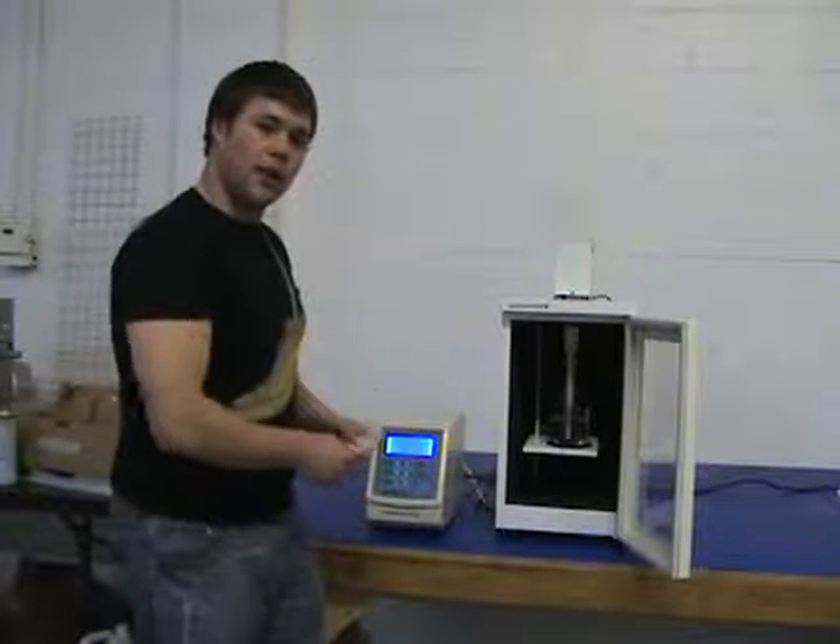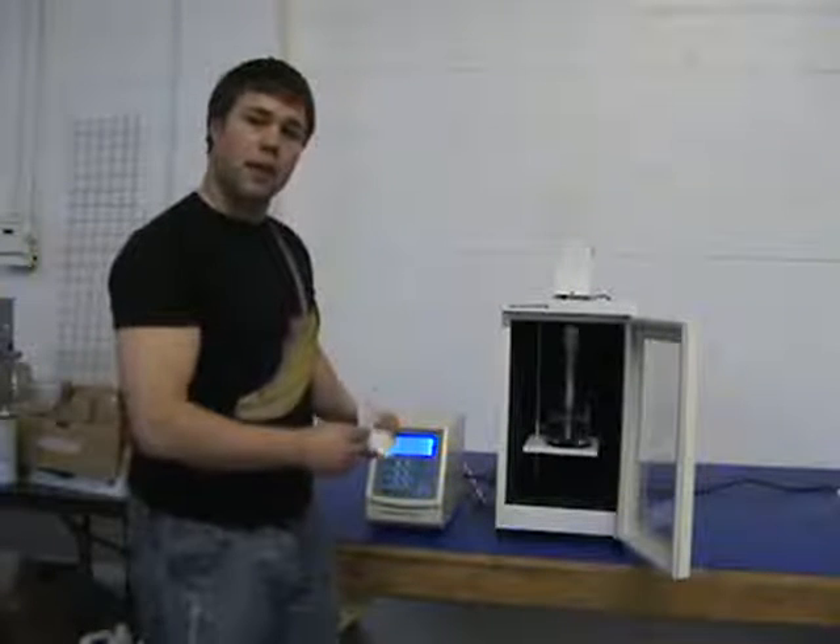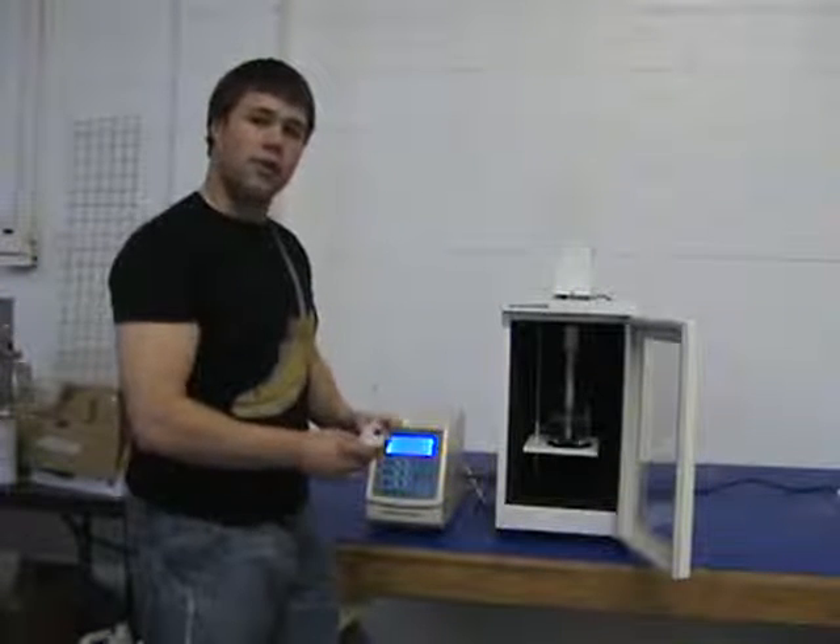With this device here, we can homogenize mixtures and disrupt cells. What I'm going to demonstrate is the homogenizing feature of this machine.